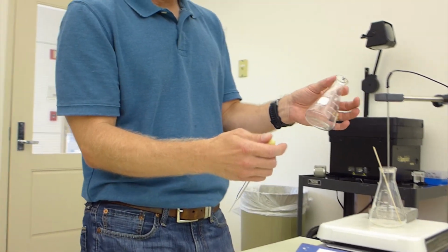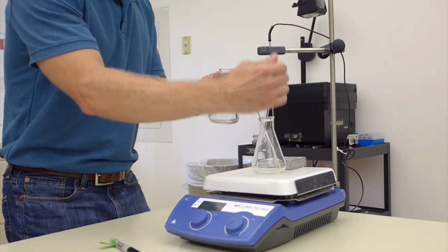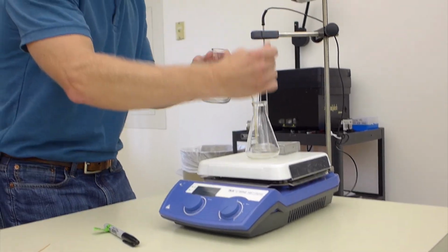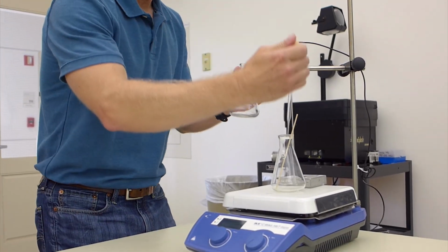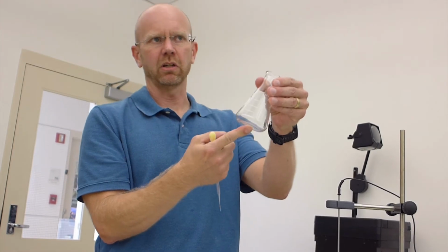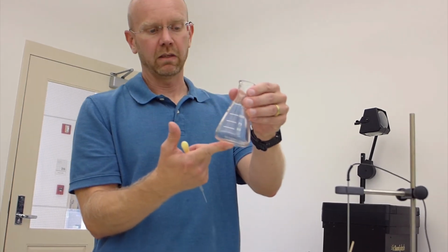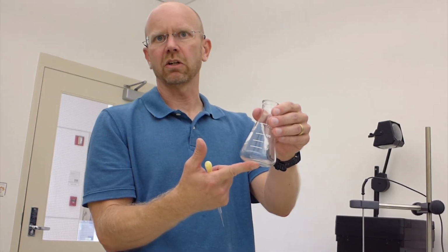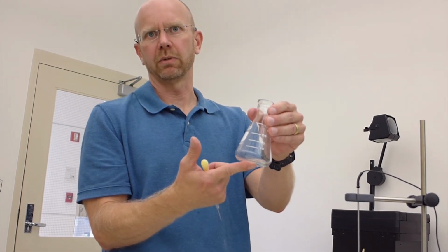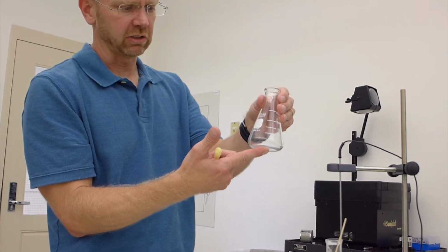So the best way to do it is to put your solid in an Erlenmeyer flask and then use a pipette to transfer some of that boiling solvent into the solid. Okay, so I'm transferring it, and I'm swirling it around. And in here is going to be a little bit of solvent and a lot of solid initially, right? It's hot solvent, so it might start dissolving, but we've only added just a little bit of solvent, right? So it's not fully dissolved yet. We haven't made that supersaturated solution.